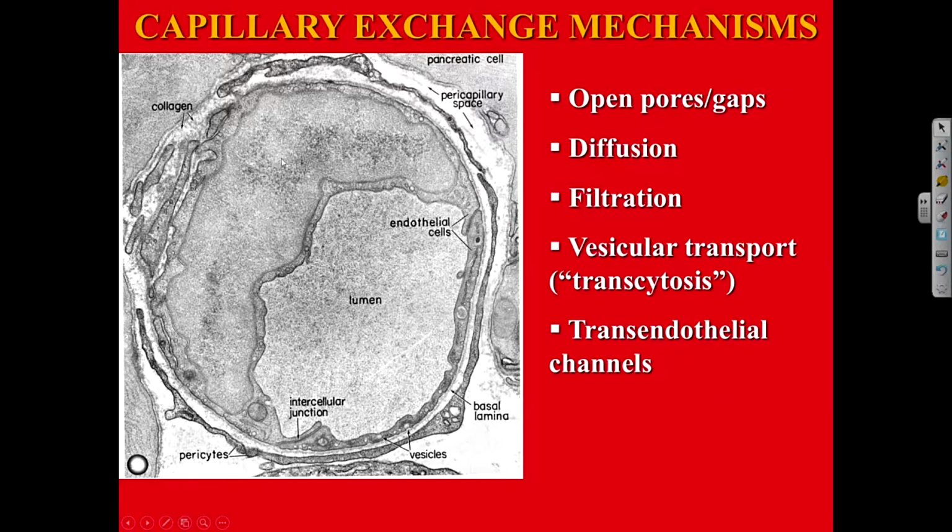So here's the nucleus, cytoplasm of endothelial cells. Here's the lumen. And so what do these capillaries do? Well, sometimes you can have pores or gaps in them, depending upon the type of capillary. Obviously, fluids and small molecules can readily diffuse into and out of the capillary, particularly if they're continuous or fenestrated. There'll be partial filtration of compounds passing across the membrane or the endothelial cytoplasm.